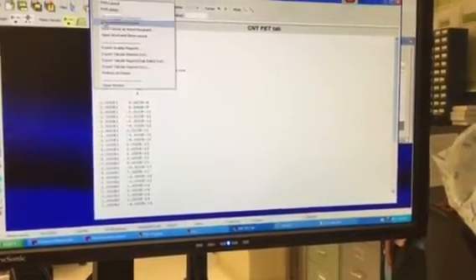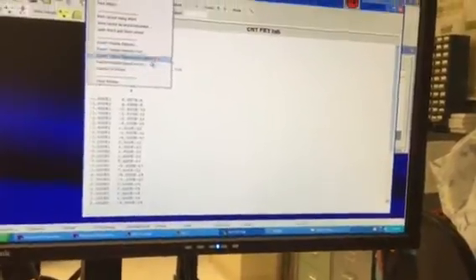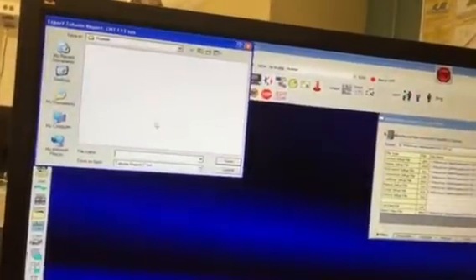Can I export? Yeah, you can export. Go right ahead. Do all of that, and then that's the origin data you can process. I guess both are okay. Either one really. You can load it nowadays.